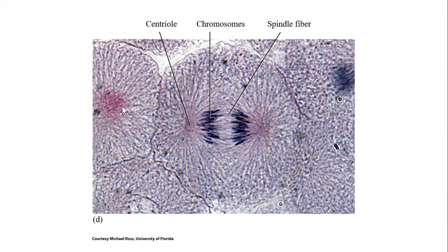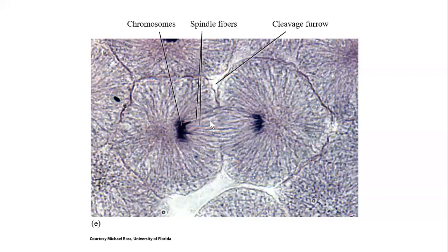I'm going to digress a little bit. Take a look at up here to the left. This is in interphase. Right? Okay, moving on. So the last phase of cell division is called telophase.